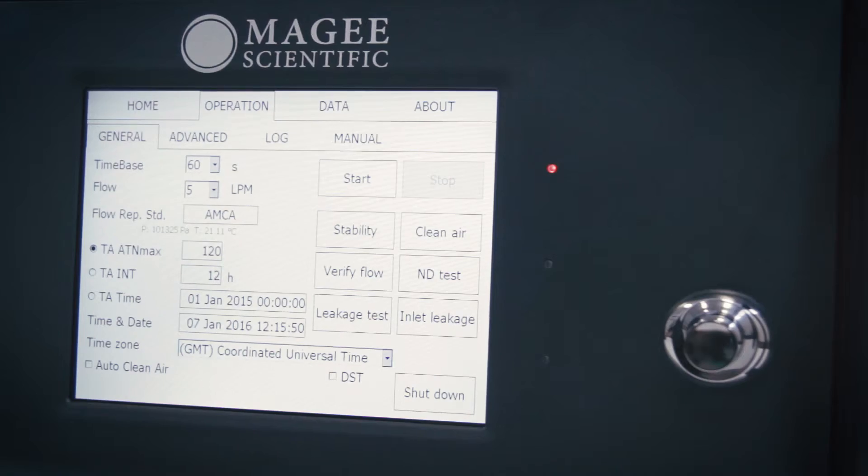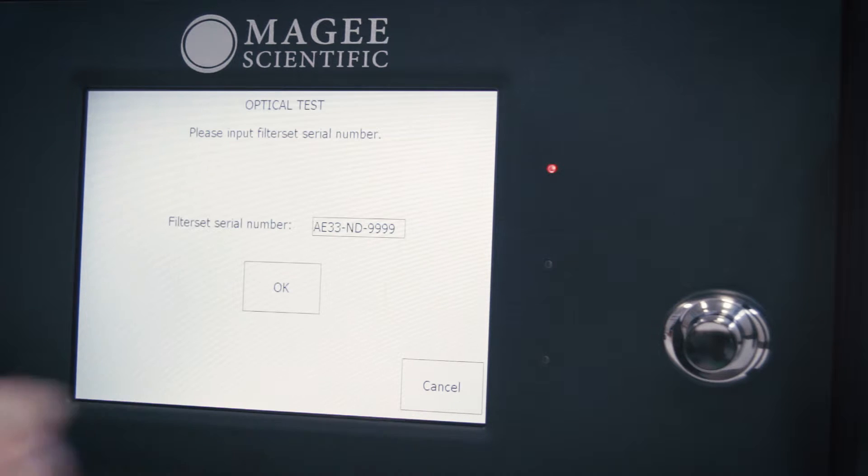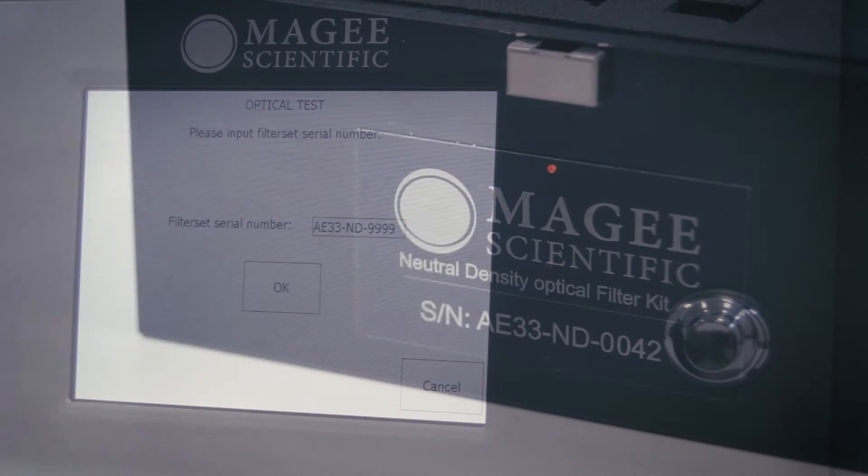If the measurements are running, press Stop. Go to the Operation General screen and press the ND Test button to start the test.